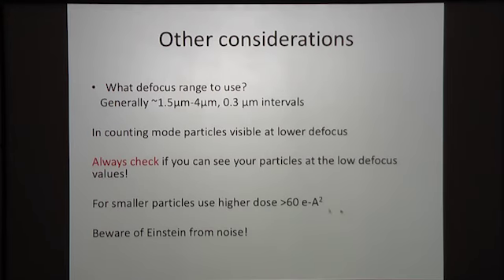Another consideration for smaller particles, it might be advantageous to put more dose to boost those low frequencies, and then you can deal with the radiation damage later in RELION.